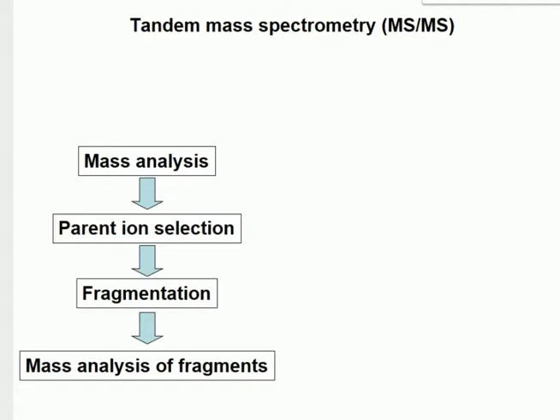And I'm going to use the phrase intact mass a lot and talk about precursor ions, but always remember that what I'm talking about are those proteolytic peptides. So when I say the intact peptide, I don't mean the protein. Okay? The protein's already been digested into peptides, and we're looking at the mass of the peptides, and then we're looking at the peptide fragments.